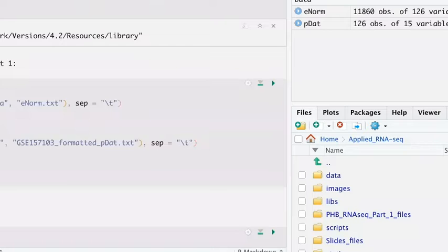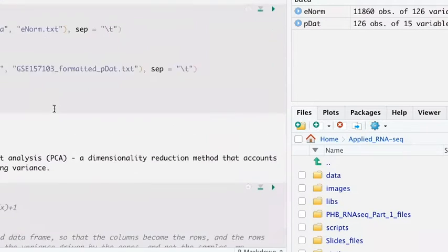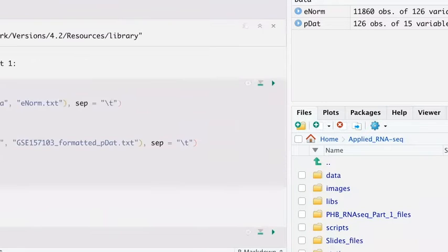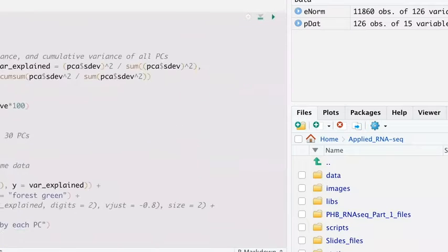Okay, so going back to our worksheet. I'll be working through the worksheet, but like I said, everything is over here. If you want, you can just copy paste all of this into the worksheet as you're going through.